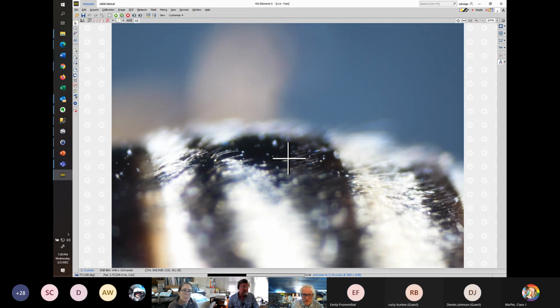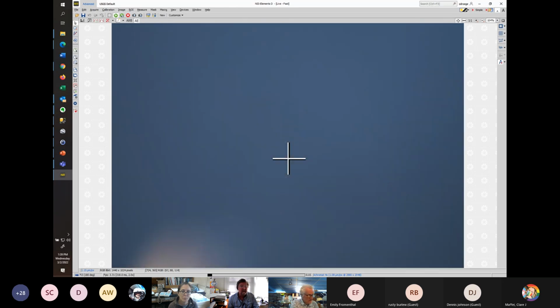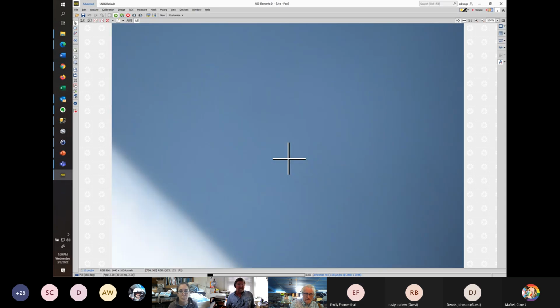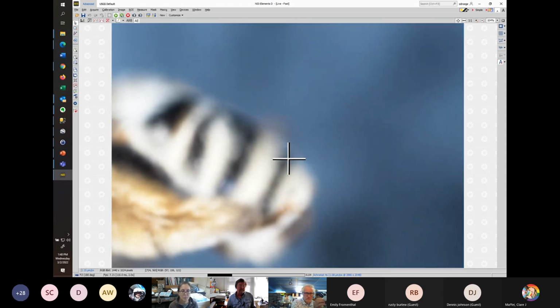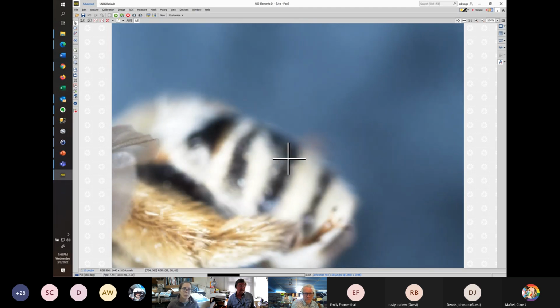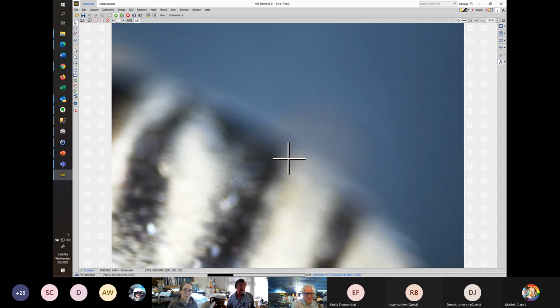It both looks like there are sometimes no hairs, and then it's hard to tell what the color of the hair is unless you go to the side, which is why we always advocate for people using their fingers so that they can rock the specimen back and forth to find and track down these things, particularly, well, is that black hair or is that bad processing?